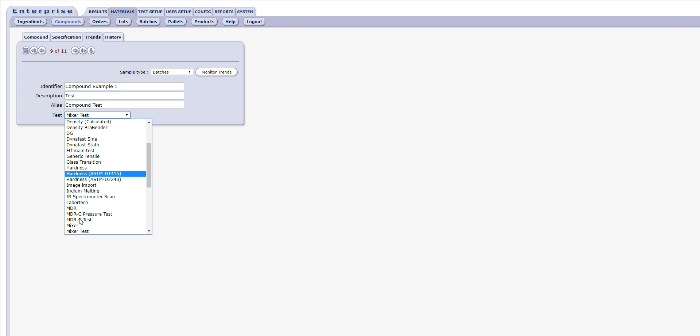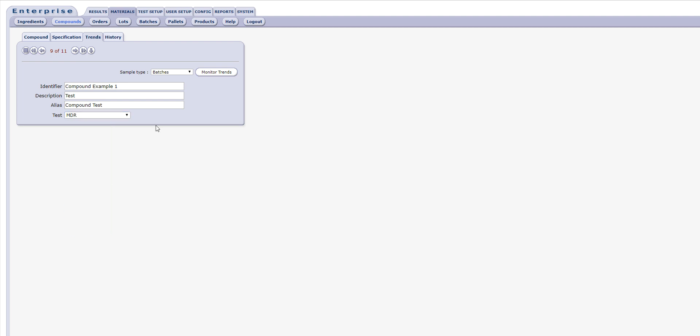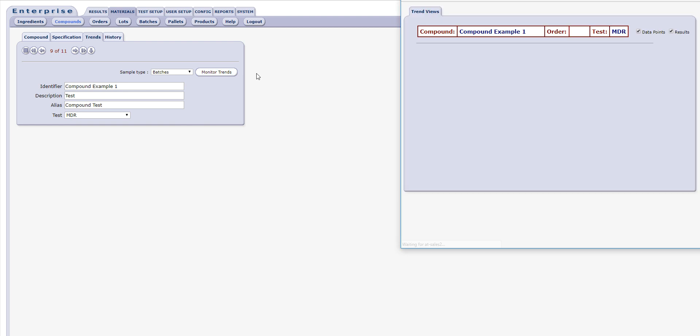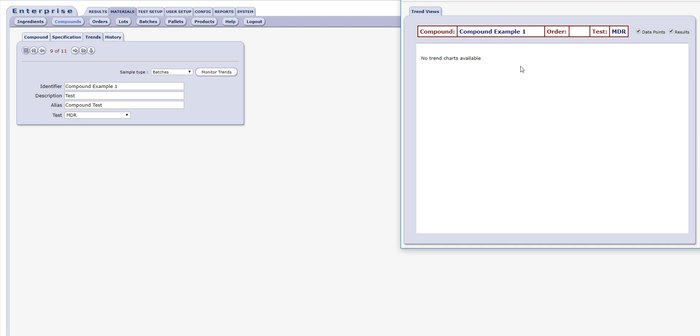The results are presented in a pop-up window displaying the trend for a number of pre-selected variables in relation to previous results, with the last dot in each chart representing the most recent result. Moving the mouse over each dot will show information on the identification of the sample tested.